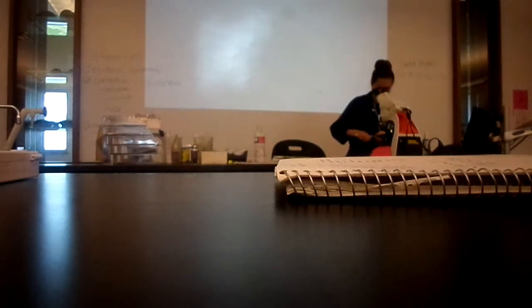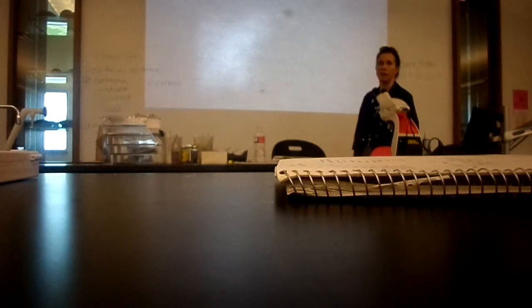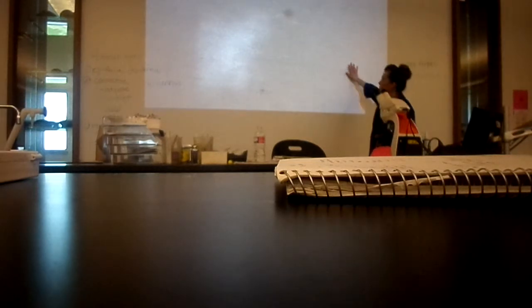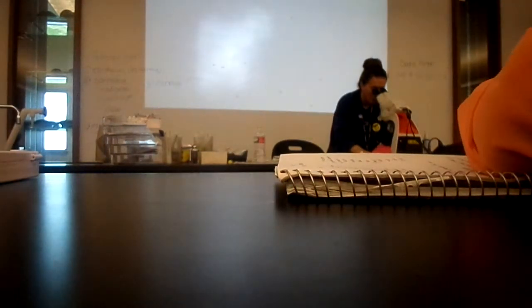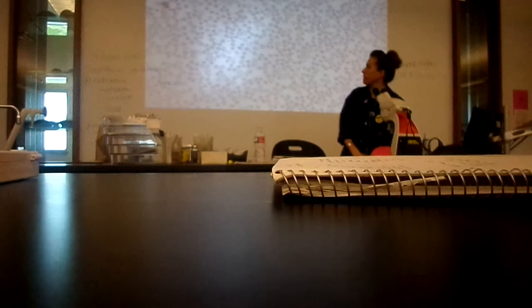All right. So that's another connective tissue. The last connective tissue that we're going to look at today is blood. You need to look at the slide that's the human blood smear. Now remember, we looked at blood before when we looked at that little trypanosoma parasite. Remember, it's a hard one to focus. This is what you want. You want all of that field of red dots. And we have to go on the highest magnification.